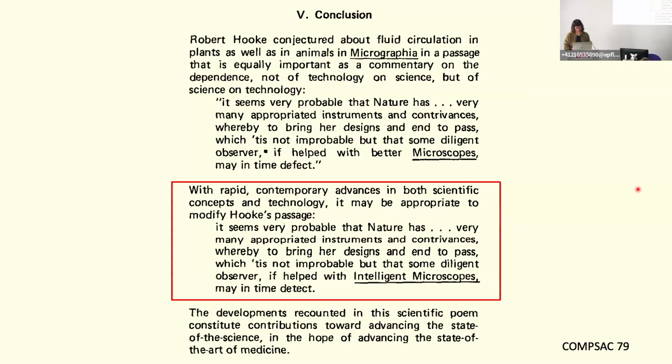So with rapid contemporary advances in both scientific concepts and technology, it may be appropriate to modify Hooke's passage. It seems very probable that nature has very many appropriated instruments and contrivances, whereby to bring her designs and end to pass, which 'tis not improbable, but that some diligent observer, if helped with intelligent microscopes, may in time detect.